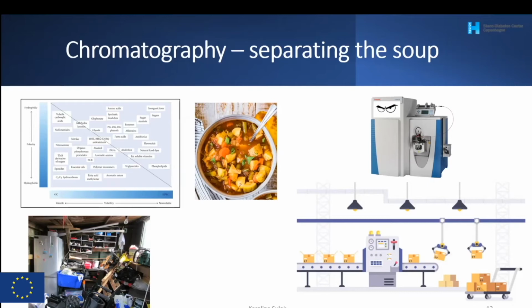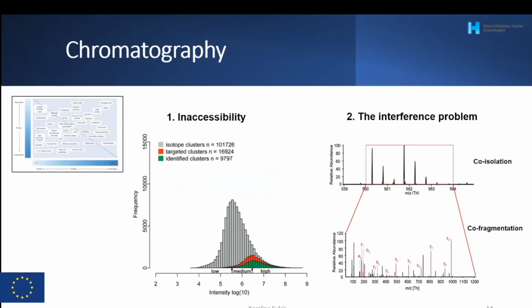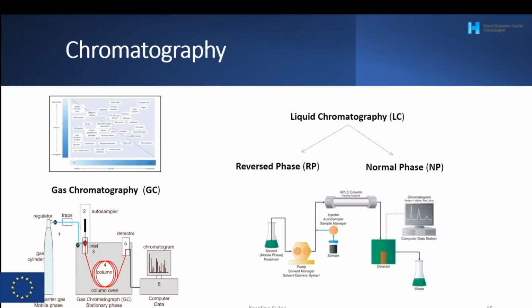It will not be able to process it, so we have to make a streamline, so that each metabolite goes one by one to the machine for being analyzed. We do that because we want to make the metabolites accessible for MS and MSMS, and we do not want different types of interference between them. As I said, there are a lot of them, and there is a huge mix of different information, especially in the untargeted one.